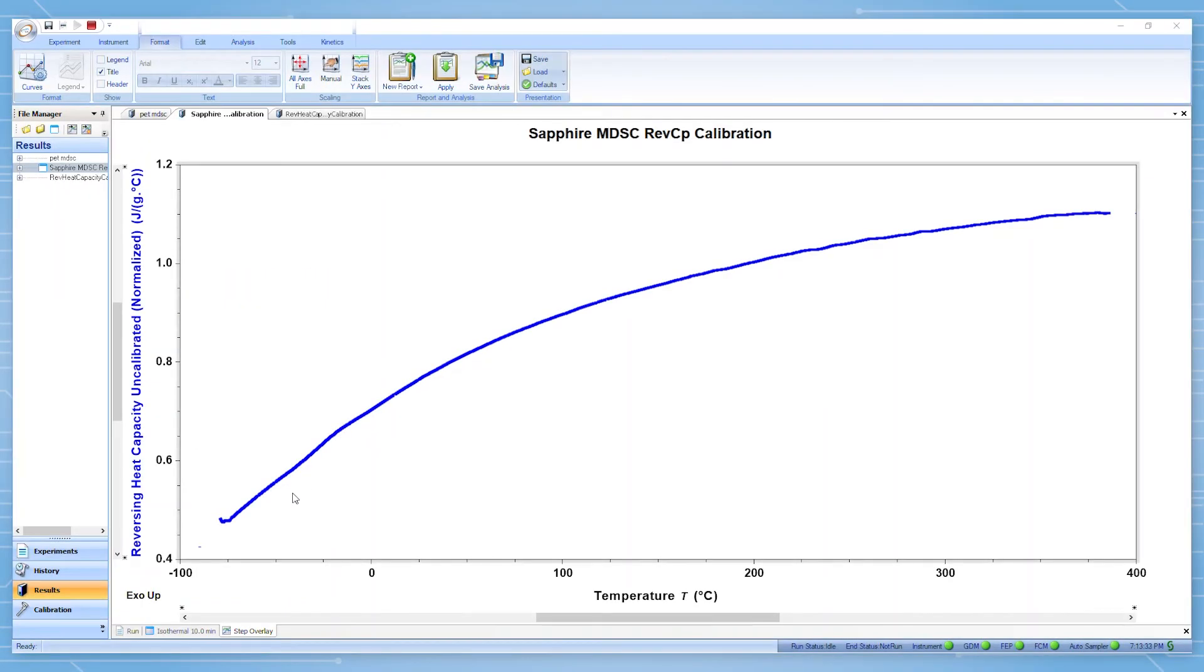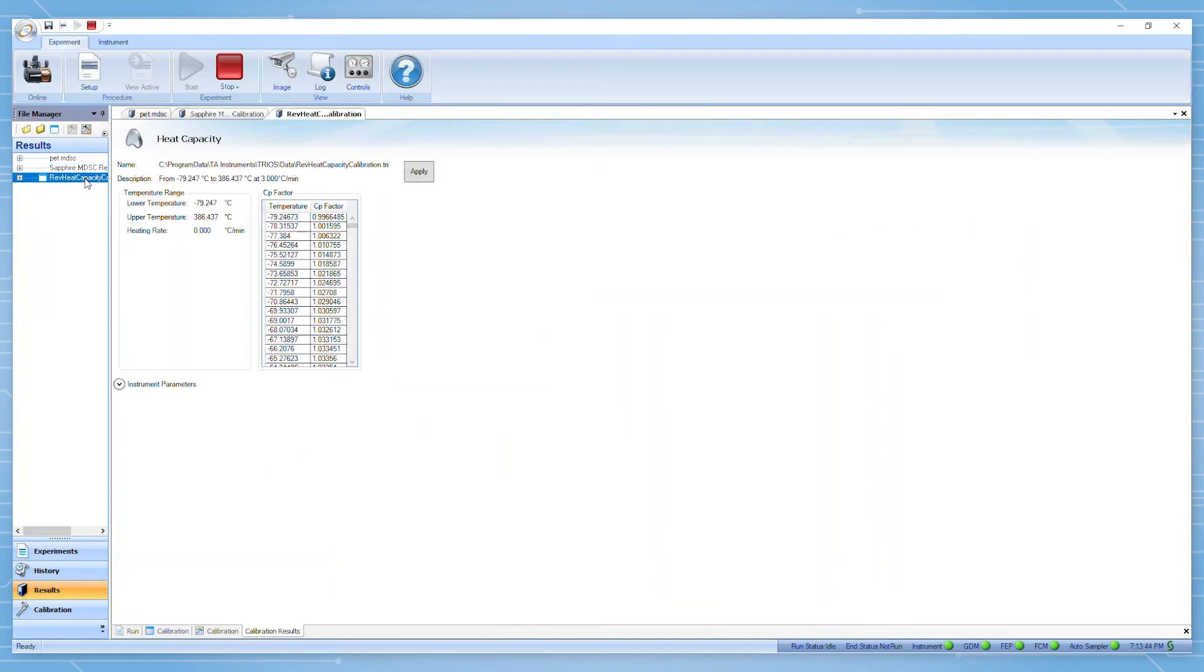At the conclusion of the experiment, you will find the data of the run which was just completed in the results pane. You will also see a file containing the calibration results. There we can see the correction factor which has now been applied as a function of temperature.